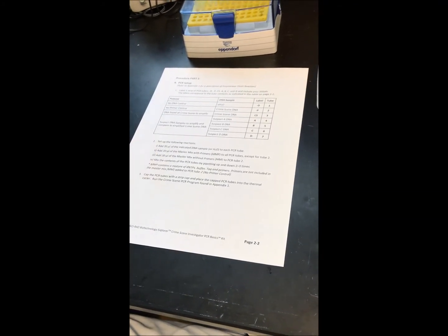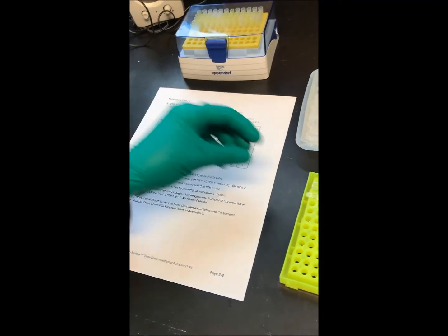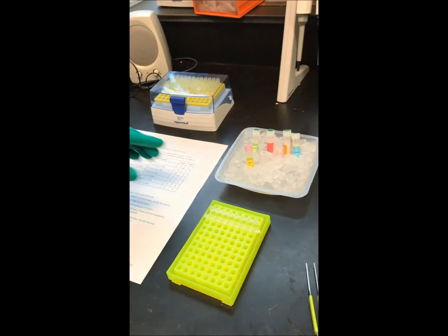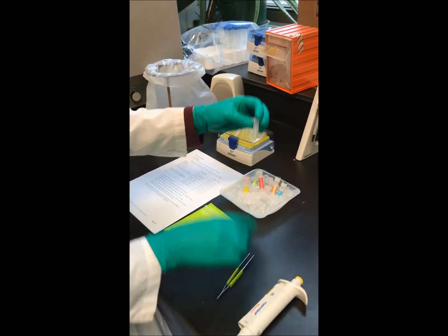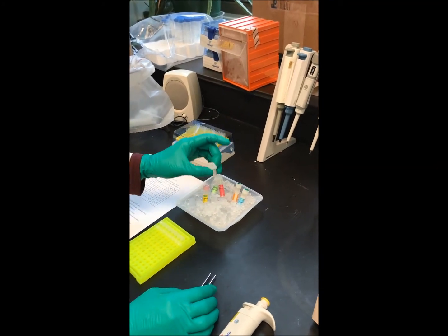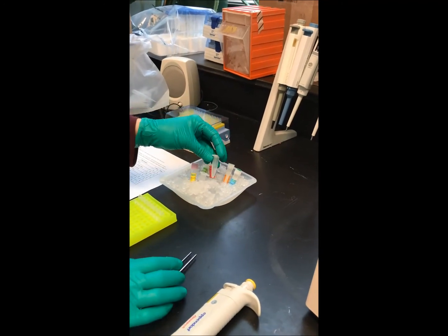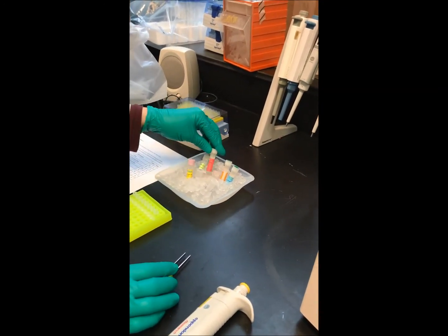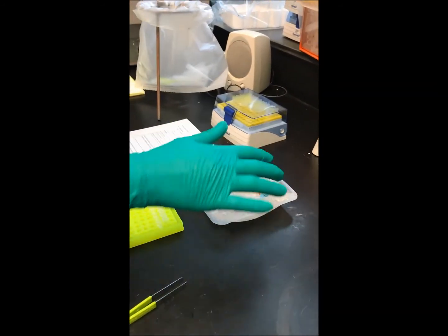So obviously we'll need DNA, crime scene DNA, suspect DNA. We need master mix that contains the nucleotides, the buffer, the polymerase enzyme, and the primers. And so we're going to mix everything up inside the tubes here. So we're going to have to prepare the DNA. We have the hair follicle inside here with some water. We've boiled it, and it contains the crime scene DNA. So that's the hair follicle here. And here we have suspect DNA that were obtained from various suspects. We have 4 of them.